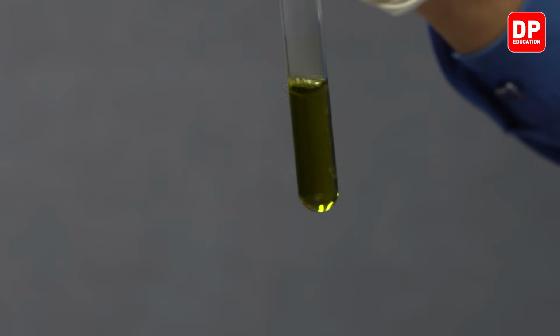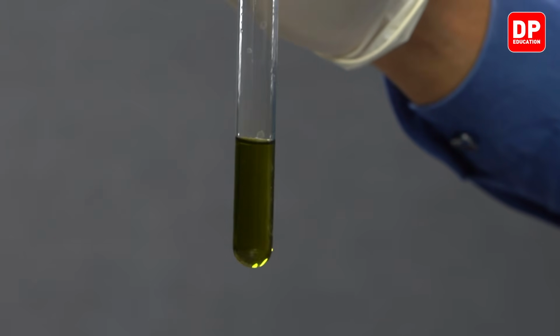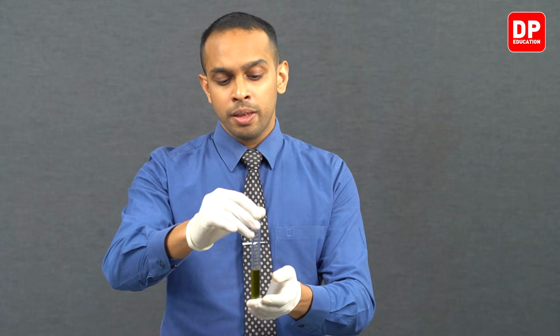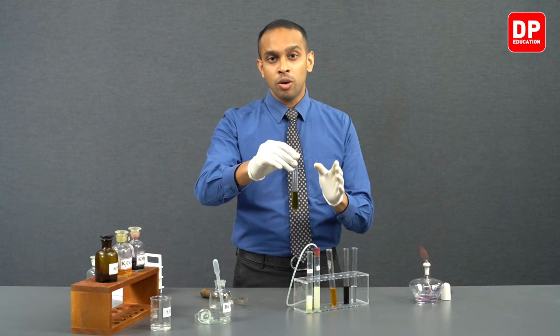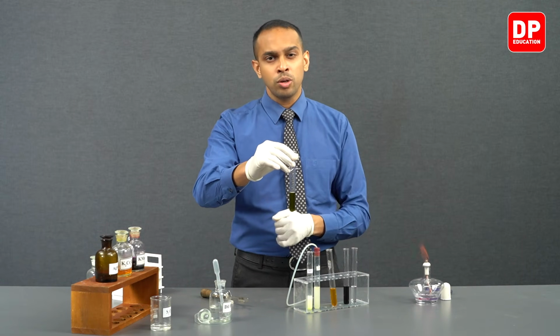You can observe here, this solution is green in color due to the presence of chromium 3+ ions in aqueous medium. So what has happened to the sulfur dioxide that was sent through acidified potassium dichromate? Sulfur dioxide got oxidized to form sulfate, and dichromate got reduced to form chromium 3+.